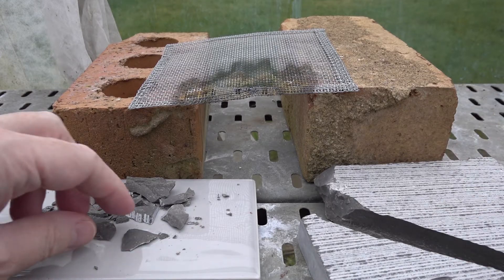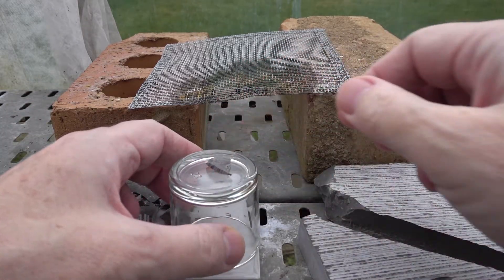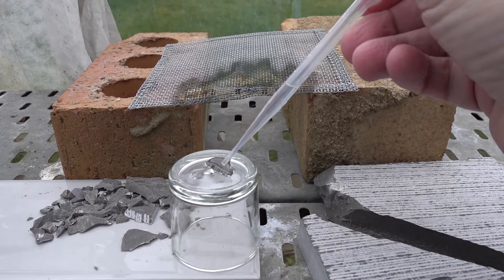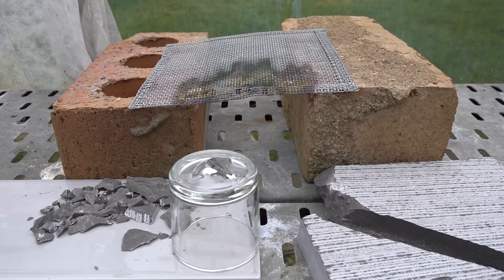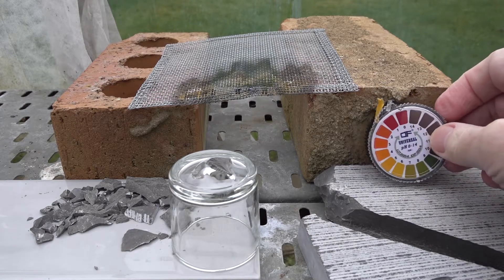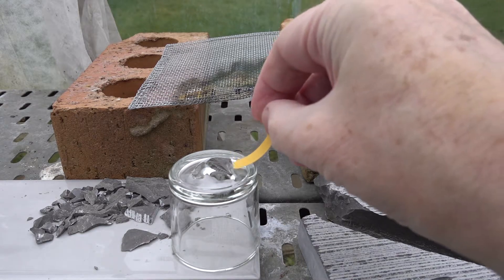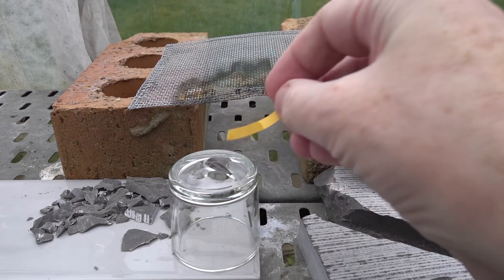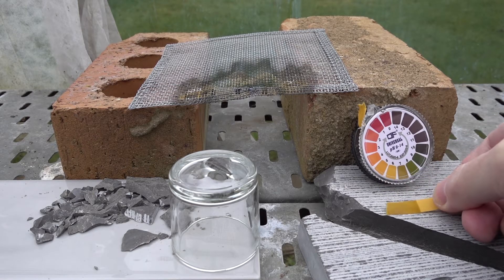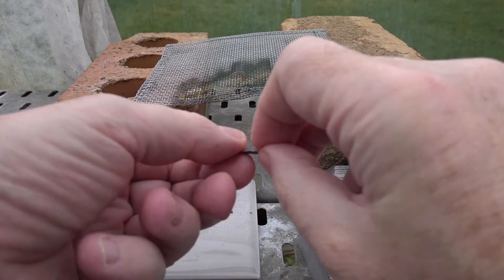Here we have our sample of limestone tile — we've chipped a bit off with the hammer. Now, taking a small sliver of the material, we're going to place it on the upturned glass and add some deionized water to it. Next we test the pH of the water in contact with the stone using pH paper, and you can see it reads around pH 6 to pH 7.